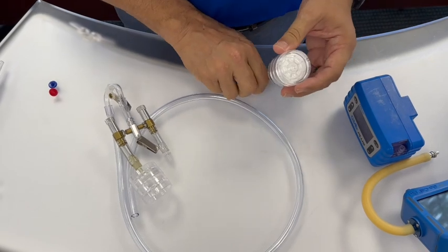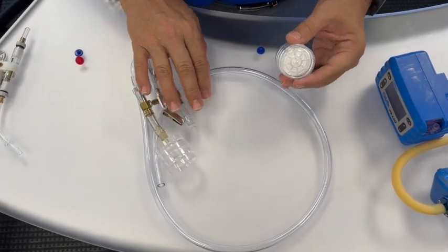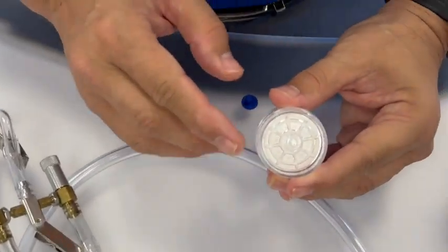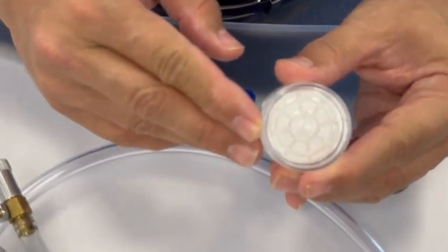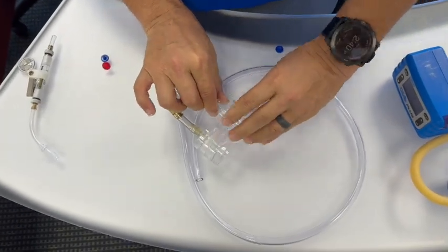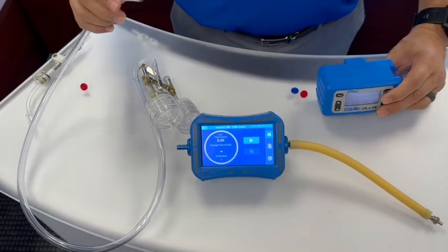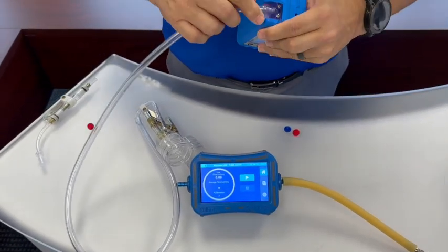Once the red and blue caps are removed, attach the top of the filter cassette to the manifold. Please note that the top of the cassette has grooved notches inside that look like a boat steering wheel. Next we'll connect our sampling train up to our Gil-Air Plus sampling pump.